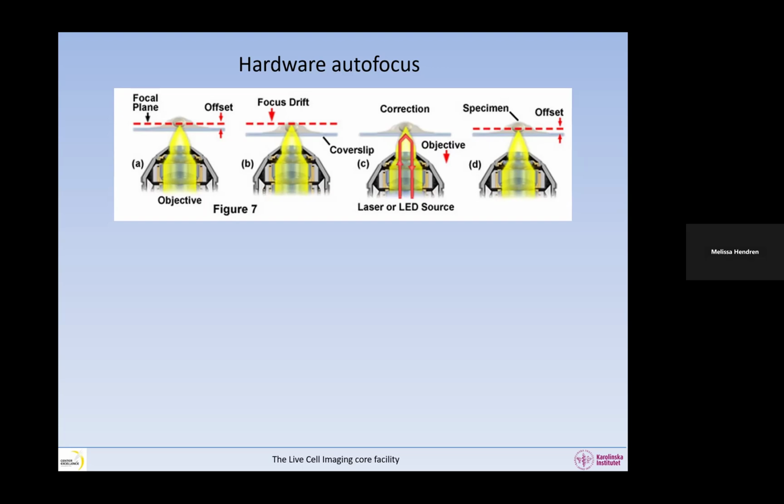Okay. As long as you don't have to go between wells or long distances, because otherwise you smear everything. So that's also something to keep in mind: if you have to travel a lot, then it doesn't really work with oil. So these are the types of compromises that we have. At one point, it works very well, as Sylvie said, and we used it ourselves, but if you start to have to move between wells, then with oil you might be in trouble. Then it's better to have a water dispenser.